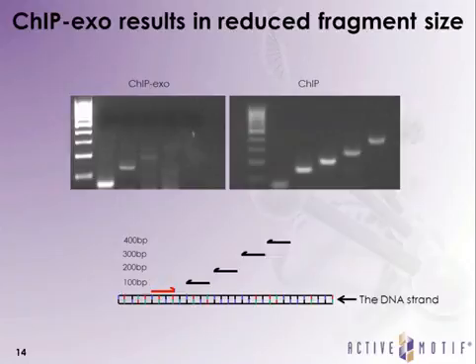And to give you an actual pictorial reference of what ChIP-Exo is exactly doing, you can see ChIP-Exo and its function by doing a walking primer reaction using PCR and then running these out on an agarose gel. So what you do here is you have your DNA fragment and an identified binding site for the transcription factor of interest.